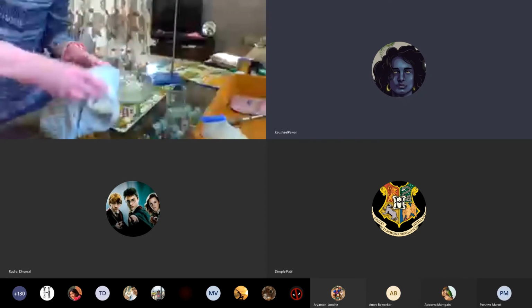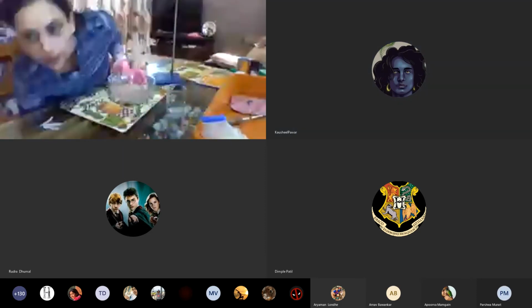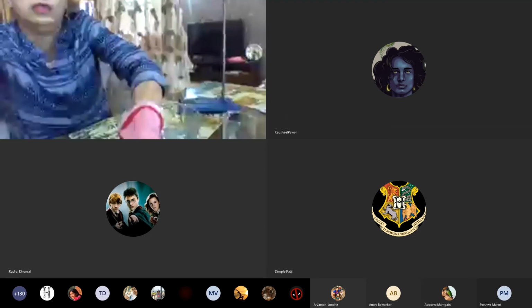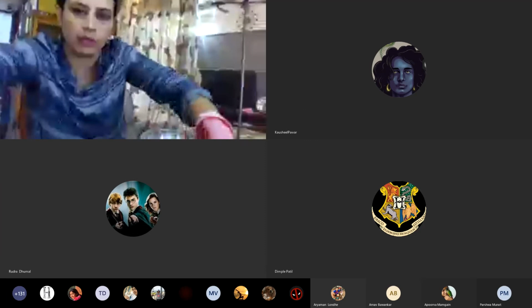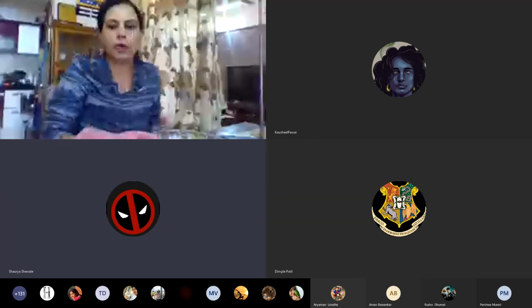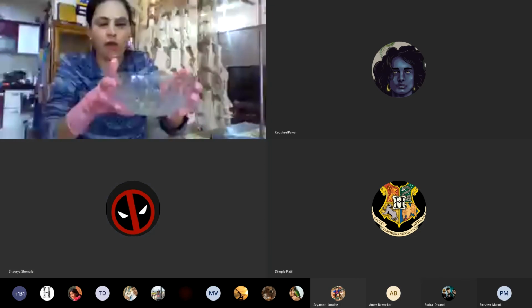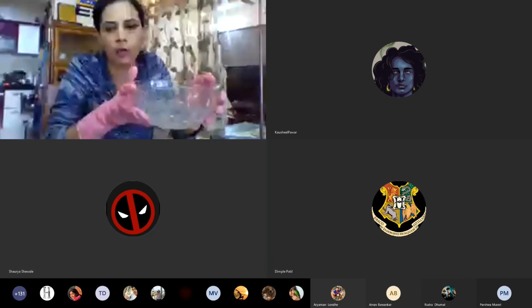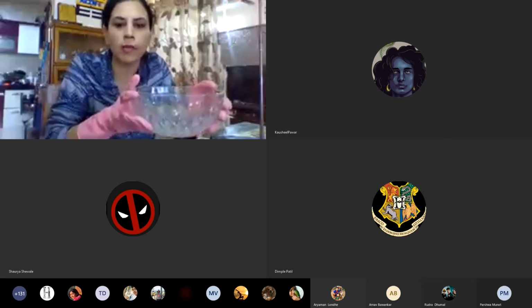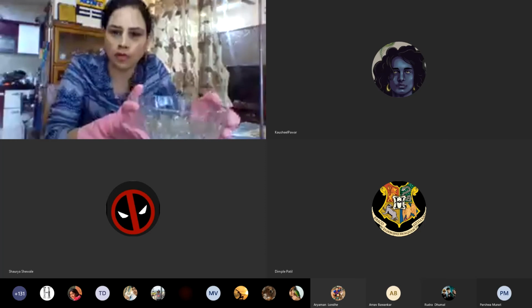Ma'am, what do we have to write in the observation? Please write down: sodium reacts with water forming sodium hydroxide. So right now in this bowl we have sodium hydroxide, because sodium has reacted with water forming sodium hydroxide.